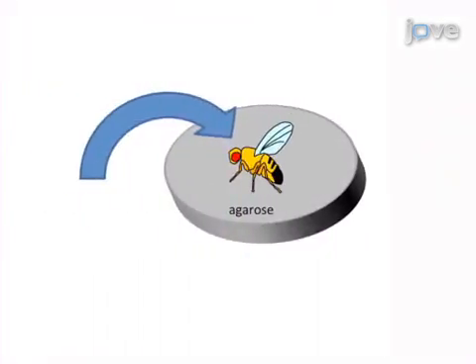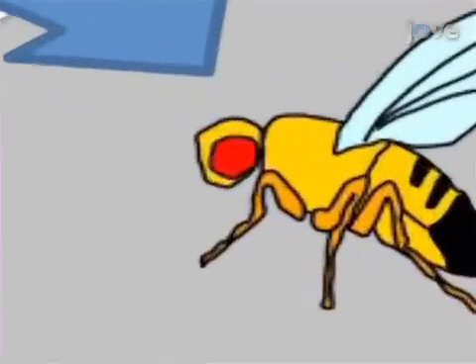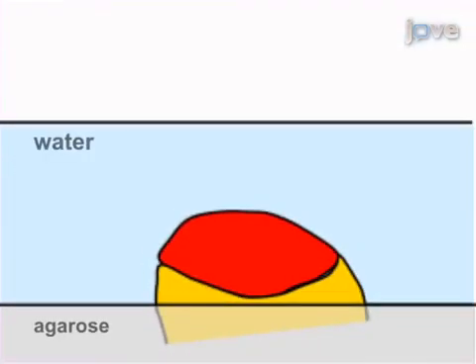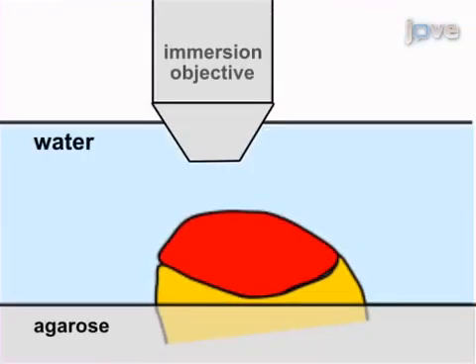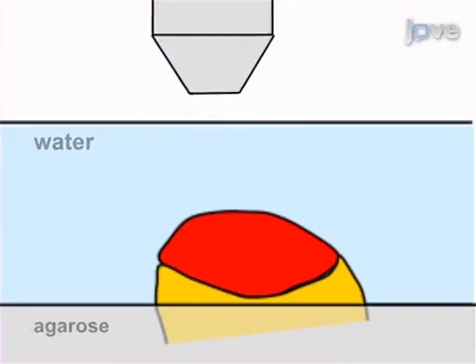As a second step, living flies are embedded into agarose, which maintains the fly immobile. Next, the retina of the immobilized living fly is imaged with a confocal microscope in order to view mosaic photoreceptor neurons.